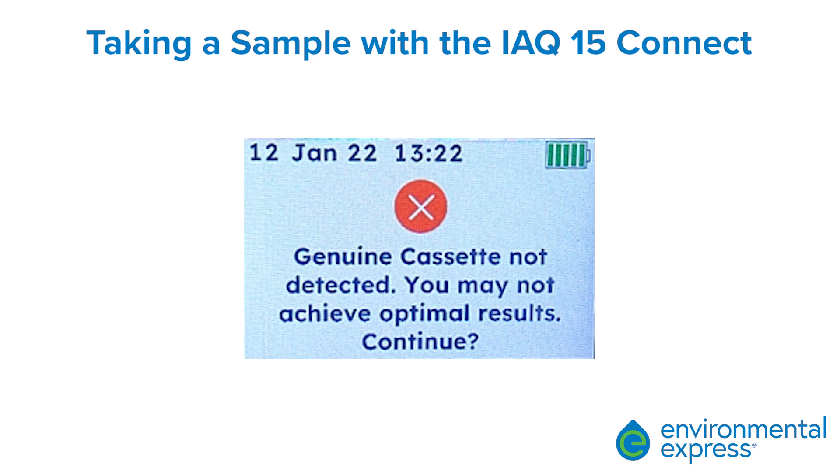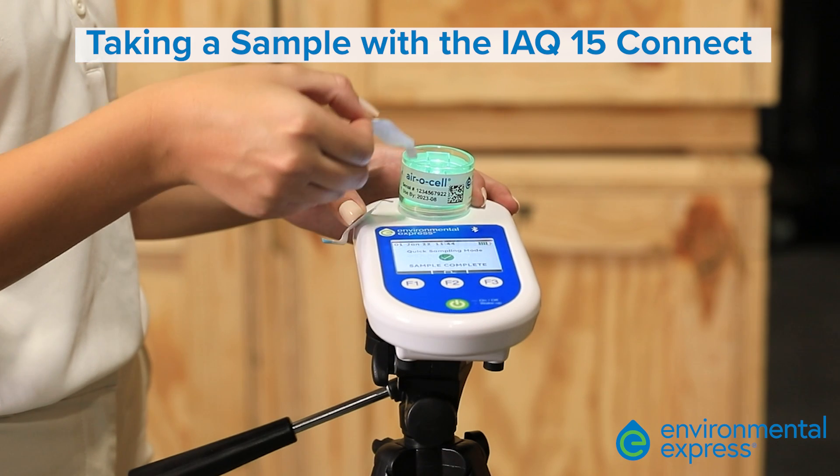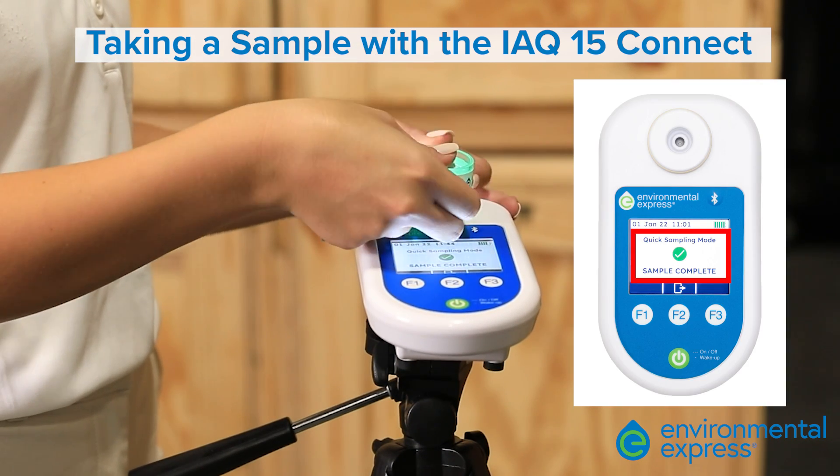Please note: if you're not using a certified Environmental Express cassette, a genuine cassette not detected message will appear. If you're using other manufacturers' cassettes, results may vary. A green light along with the sampling pump draw sound will indicate that the pump has started sampling. Let the pump complete sampling without moving or adjusting. When complete, the sample complete message will appear.